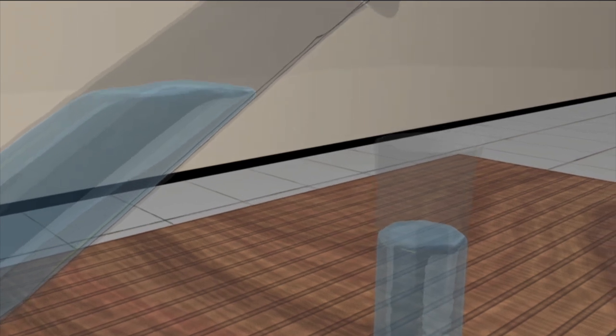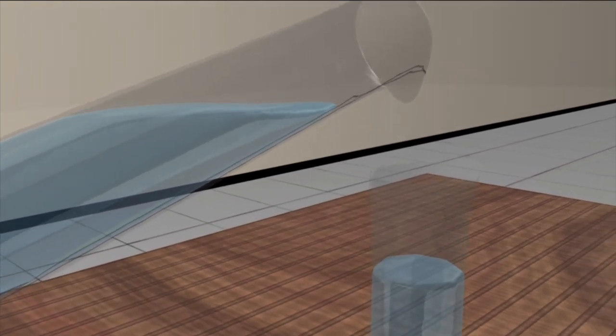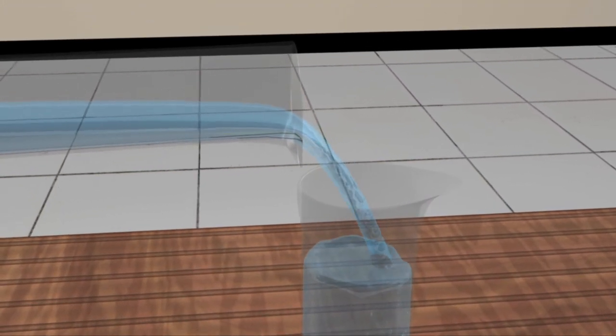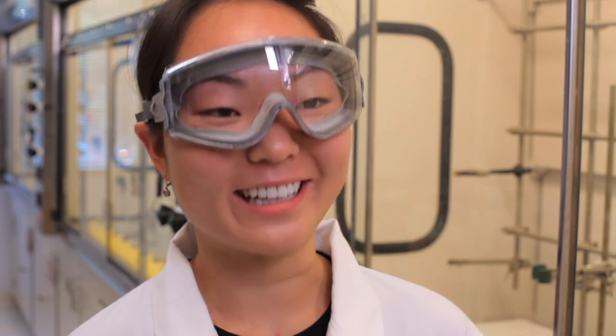I always get confused about the order of addition. Is it water to acid or acid to water? It's easy to remember if you know the reason. The problem is that the reaction between concentrated acid and water can be very exothermic. When water is added to the acid, the reaction is so vigorous that steam forms, and the steam escapes and will cause the splashing of the concentrated acid. Adding acid into the water changes the situation — since concentrated acid is denser than water, it sinks into the water and is immediately diluted. Now I get it, thanks.